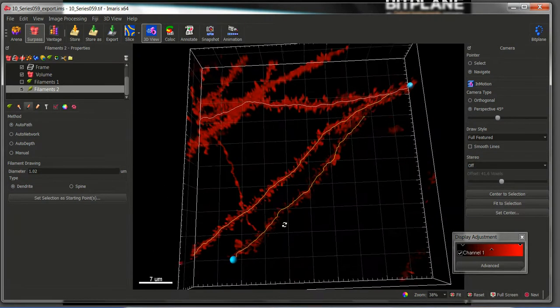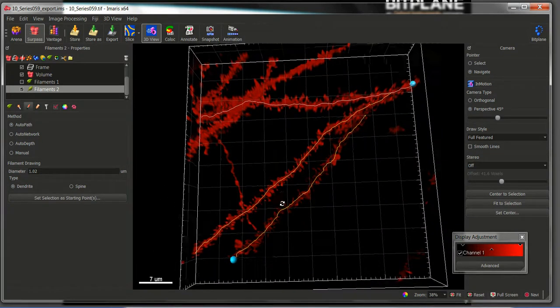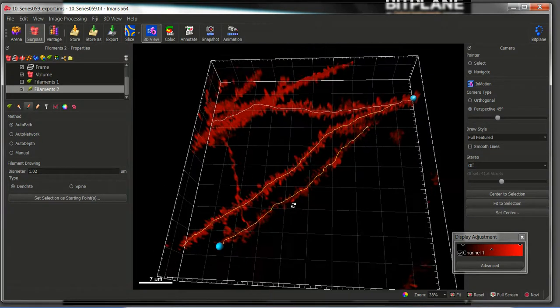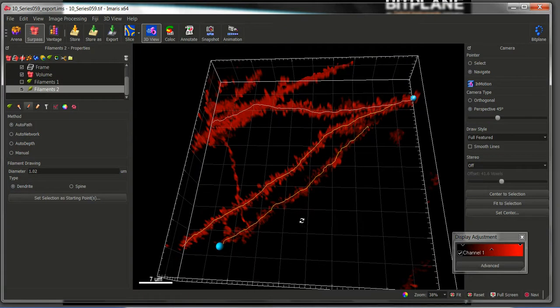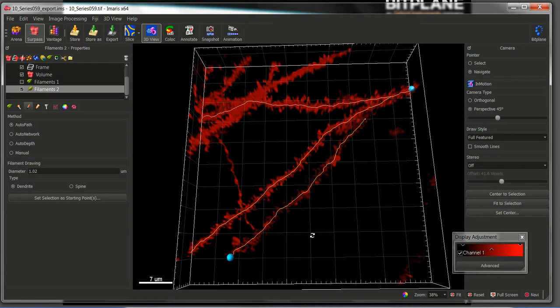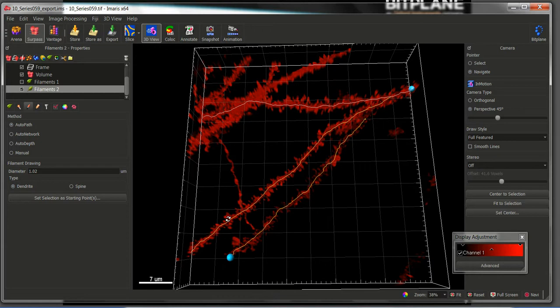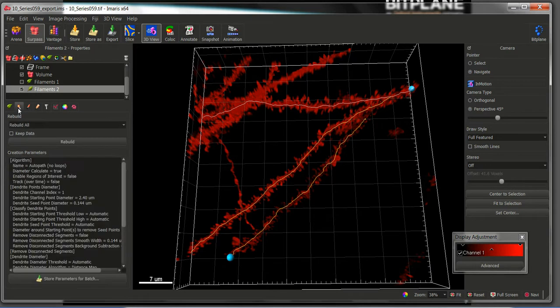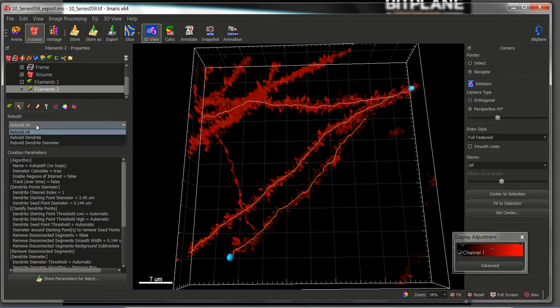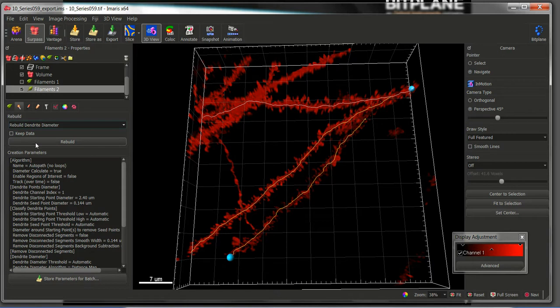Now we need to segment the spines of all these dendrites. To do it manually would be quite time consuming. So what we can do is to use the automatic tools of filament tracer in order to detect the spines. For this we click in the creation tab and in the rebuild options we will choose rebuild dendrite diameter and click rebuild.